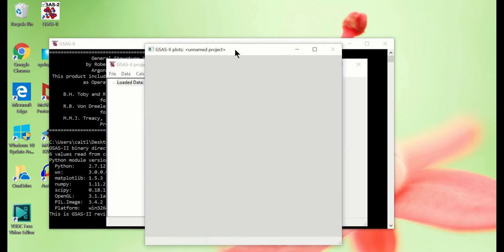The second window immediately under the first is labeled GSAS II Plots. This will contain tabbed graphical displays when appropriate, corresponding to the selected tree item. This may be a crystal structure, powder pattern plot, etc. The tabs allow you to view a recently produced plot. You may be able to interact with the current plot via the mouse, thus changing items in the data window.